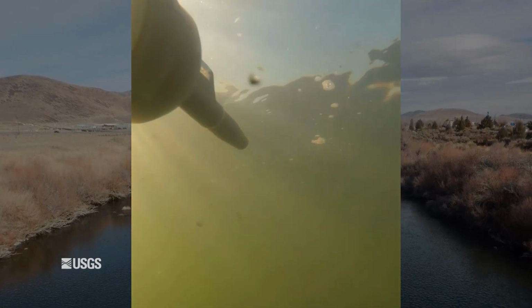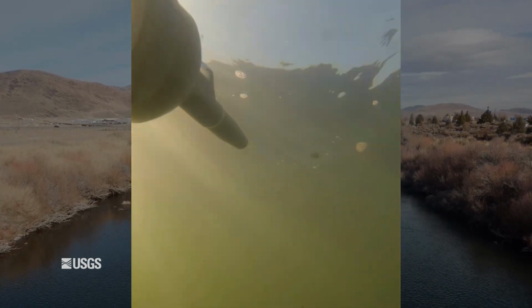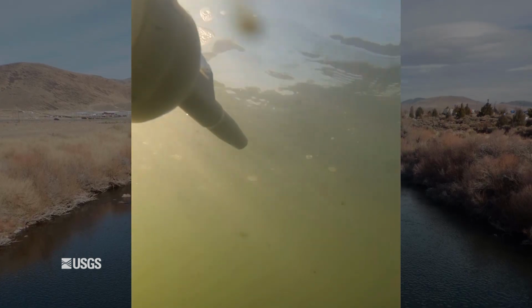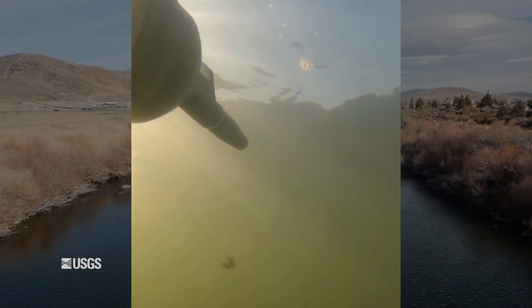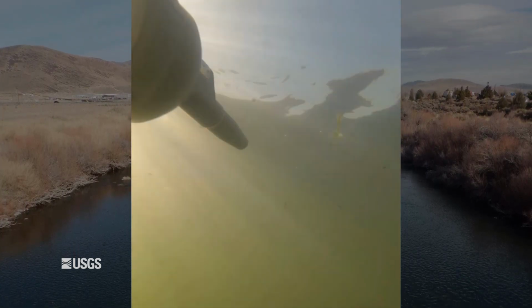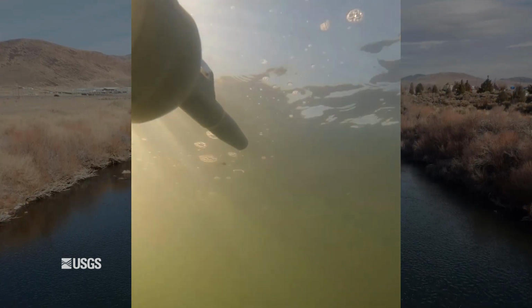We are using a DH81 sampler with a 5/16 nozzle attached under low flow conditions. And even though we have low flow, a good portion of the channel has moderate velocity. Therefore, we attach a nozzle to keep the water entering the sampler at the same velocity as the stream. This helps ensure we capture a representative sample of water in the profile while using the DH81.